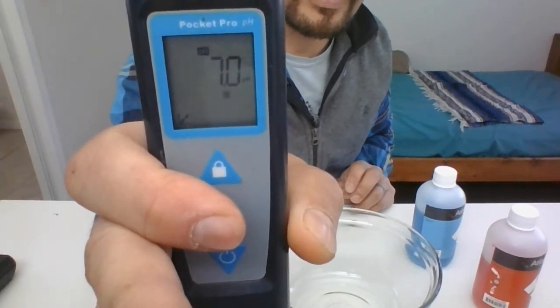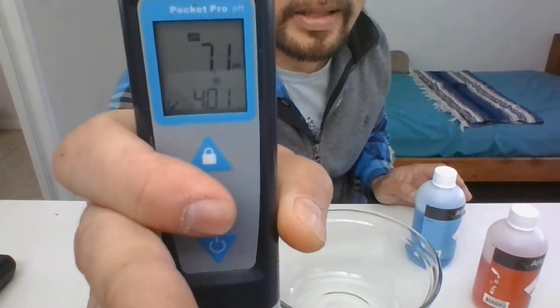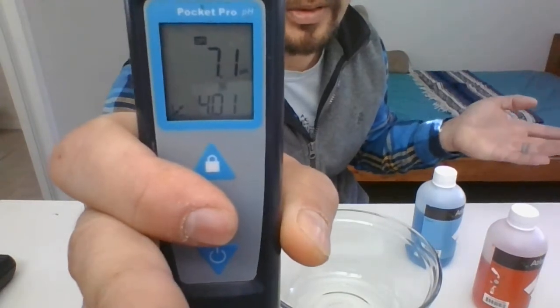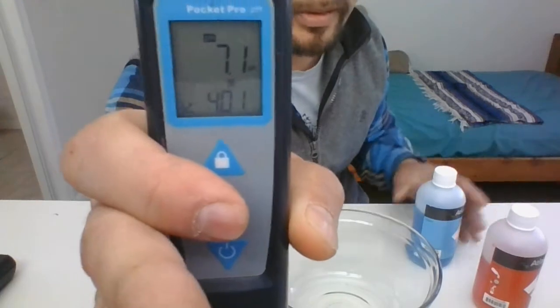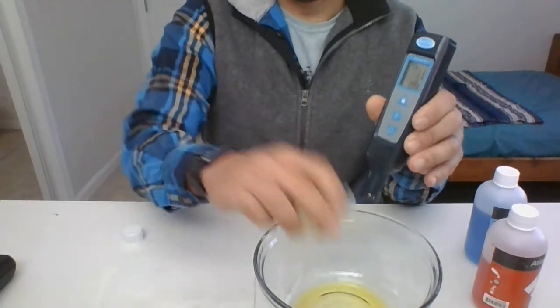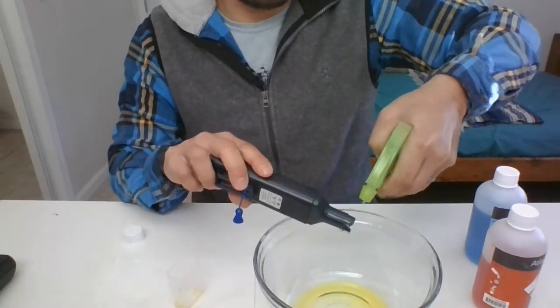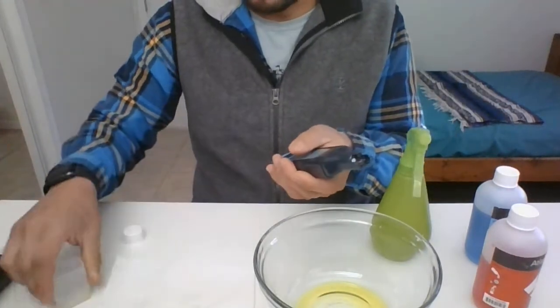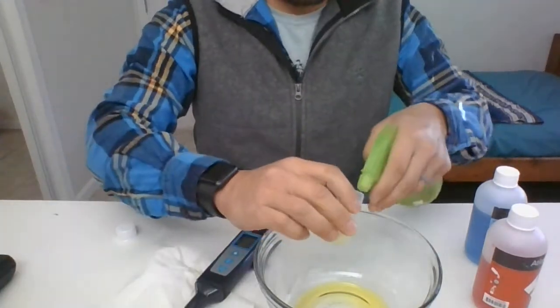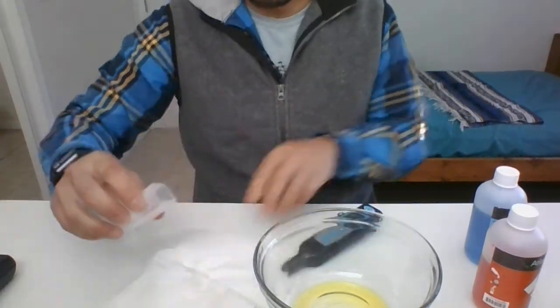It starts blinking — 7.0 or 7.3 or whatever it is — and switches to 7.1. At the bottom it's going to say 10.01 or 4.01 switching back and forth, asking which buffer you want to use next: four or ten. Before moving to the four or ten buffer, empty out the contents of the lid into a bowl and clean your reader quickly with DI water, then dry it with a paper towel. Also clean and dry your lid.